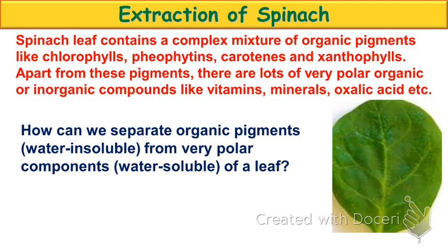Okay? Most inorganic compounds are, what's your question? Okay, we could try and centrifuge it, and that would separate based on density. That gets rid of some of it. But if it's soluble, okay, that's not going to remove it necessarily. It's only going to separate between the individual densities. Okay, and we'd have to get really high-powered centrifuges to really do anything helpful for us there.